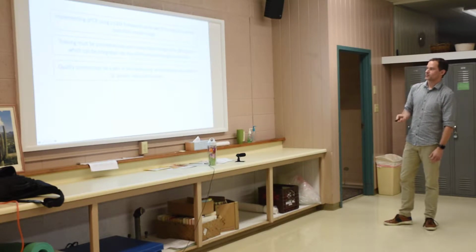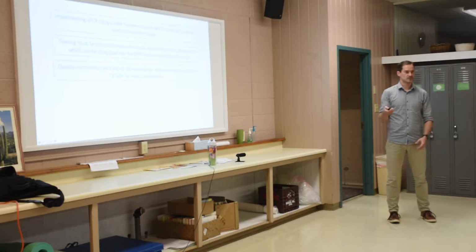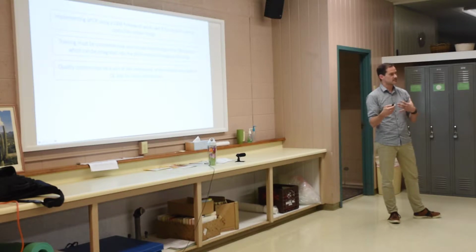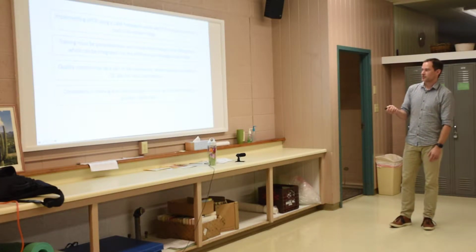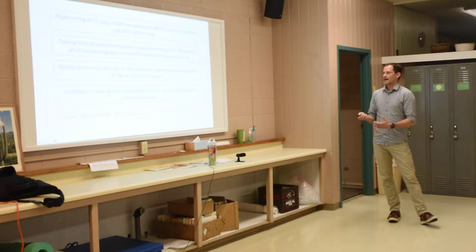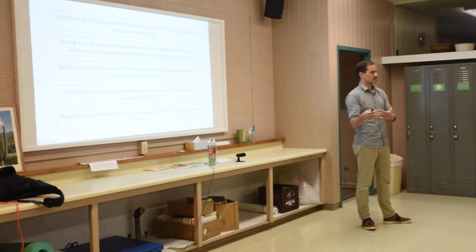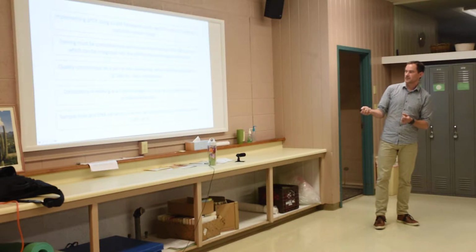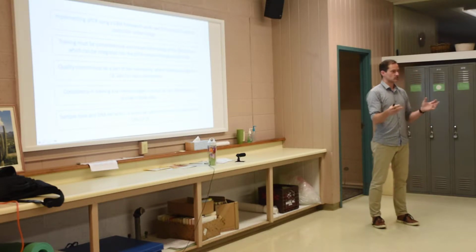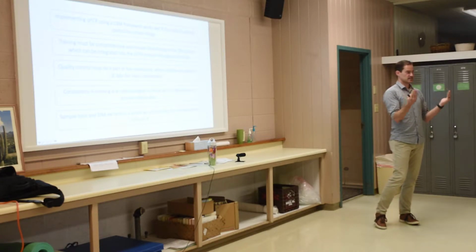Quality control also must be a really important part of the relationship. This means that we routinely will have samples that are passed on to QC labs, like the Freshwater Solutions lab, or even to us, where we run the same tests that you ran, and then we make sure that it all works and it all makes sense. Consistency in the training and methodologies is critical. We know that the sample type, meaning the amount of copies in the sample, whether a sample has a lot of fecal material in it or very little, and the DNA extraction protocol itself are the two main sources of error in DNA-based testing for qPCR. So we need to keep those things as consistent as we can.